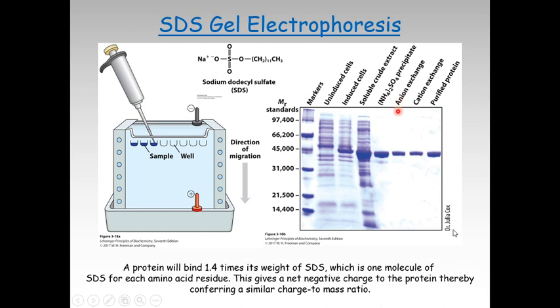After anion exchange chromatography, you do a cation exchange chromatography. And then after cation exchange chromatography, you get pure protein. And that's what you see. As you can see, these lanes correspond to the protein, right? And the approximate molecular weight of the protein is around 45,000 Daltons. Remember, the molecular weight of proteins is expressed in Daltons.